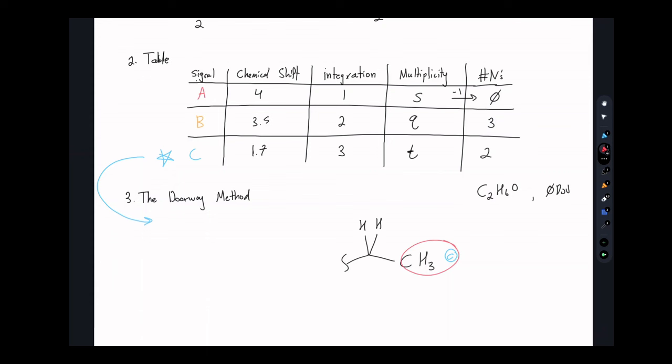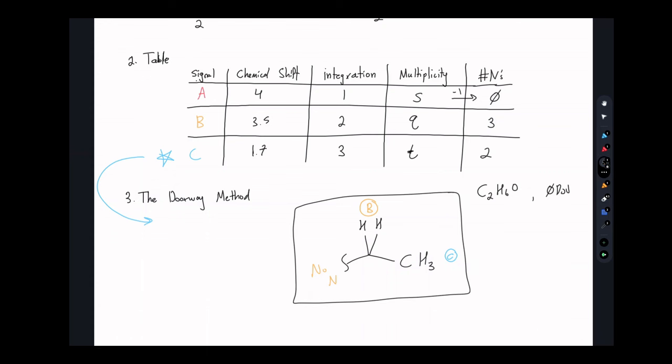So what I could say is that these 2 hydrogens have at least 3 neighbors, and that disqualifies signal A from contention, making signal B guaranteed. They have to be these 2 hydrogens. Now signal B, we may notice a higher chemical shift, but again, something to notice, not really to work with at the moment. We notice that it has 3 neighbors, which means that there are no neighbors on this side. There's no more coupling information, and that wraps up our puzzle piece.